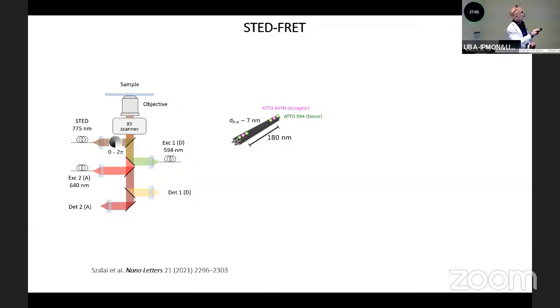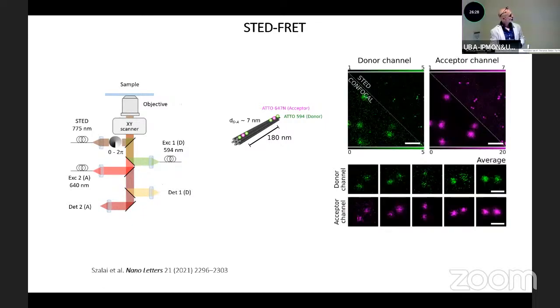So we built a DNA nanorod with a size of about 200 nanometers, and we placed, using DNA assembly, 2 FRET modules separated by 180 nanometers. That's more or less the same period of the natural structure. And we put 2 FRET modules. These modules have 2 donors and 1 acceptor. You will ask why not 1 and 1, and the reason was that the photobleaching of the donor was too high, so we just put 2 to be sure that we get at least 1 working all the time. Okay.